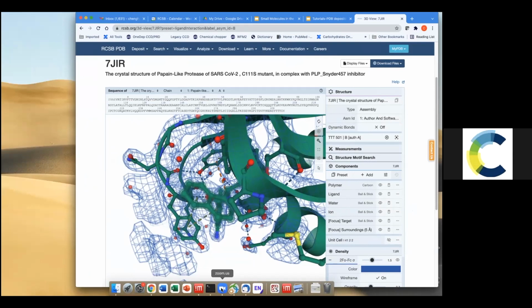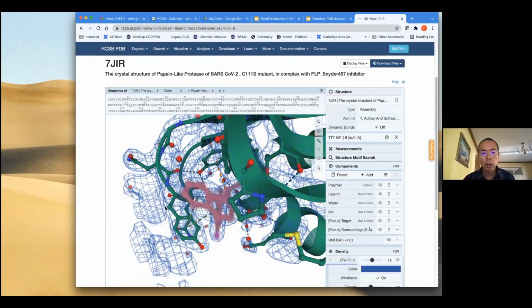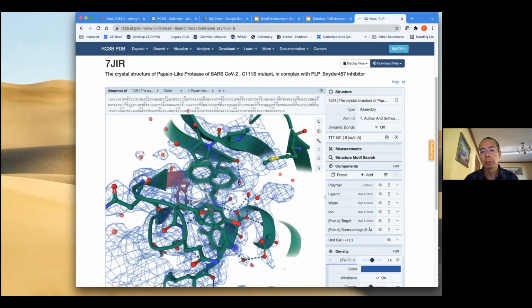Sometimes you get multiple conformations of ligands. How do they appear annotated? Multiple conformations in terms of ligand, if they're built with alternate conformations, like A, B, or A, B, C, it will show up all of them combined. You will see the alternate conformations, and then you can see the density to see whether or not the alternate conformation is supported by electron density. Usually you see a kind of blurred electron density for 2 different partially overlapped conformations.